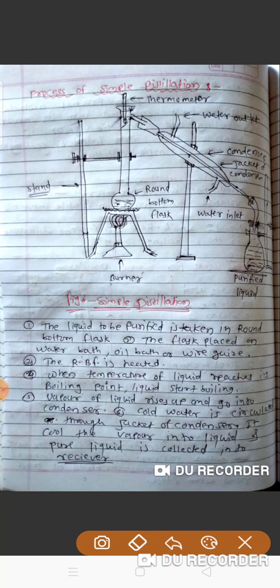Now again see the apparatus used for simple distillation. This is the apparatus. It consists of a round bottom flask. The side arm of the round bottom flask is connected to the condenser. The round bottom flask is placed on a water bath, oil bath, or sometimes on a wire gauze, and is heated to vaporize the impure liquid. This is the experimental setup.